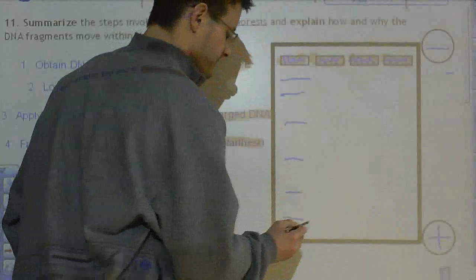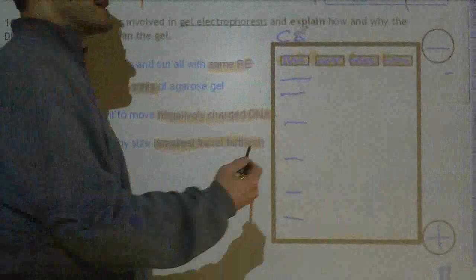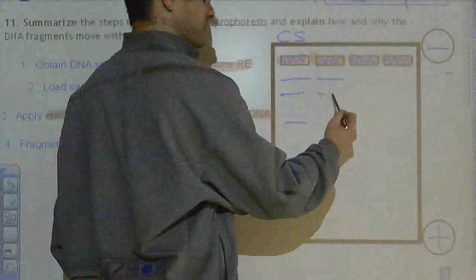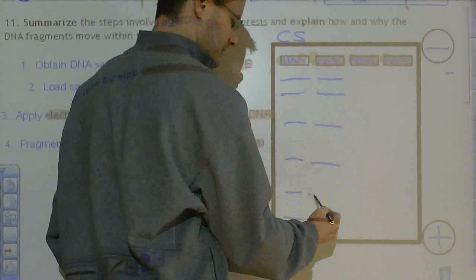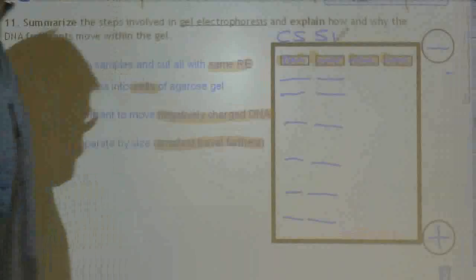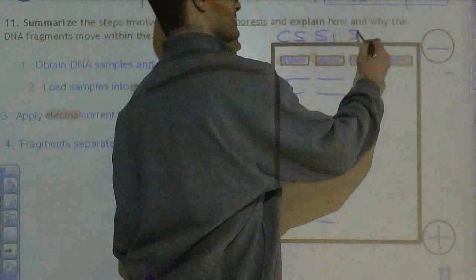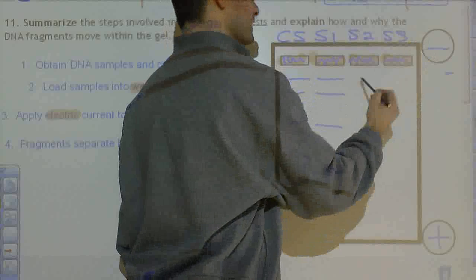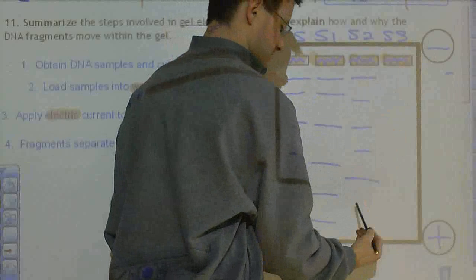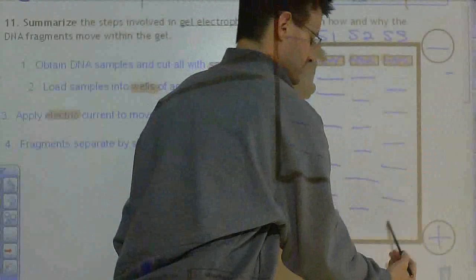Let's say this is the crime scene DNA. Let's make suspect number 1 the guilty suspect. So we're going to match his DNA up exactly, or as close as possible that I can draw. We're going to match suspect 1 with the crime scene DNA, meaning it was his DNA found at the crime scene, leaving pretty much no doubt that he's the guilty suspect. Here's suspect 2, suspect 3. We're just going to arrange these randomly. And then suspect 3, same way. Just make up some lines there.